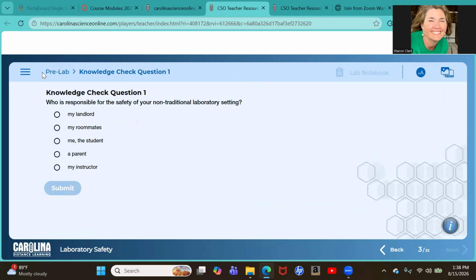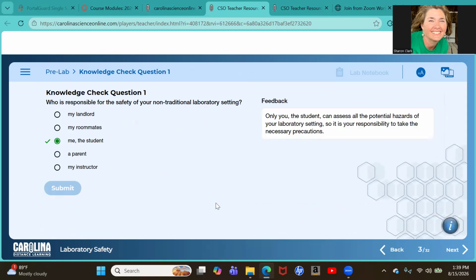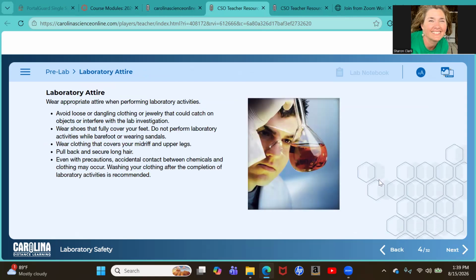And as we go through the pre-lab learning, it will ask you questions as you go along. So we'll do a lot of these together this first week, but from now on, you'll be responsible for doing those as you read through the lab kind of on your own. So who's responsible for safety? You are, okay? You're the student. You are the one responsible. Only you are going to be able to use these lab specimens and a lab kit safely in your home.